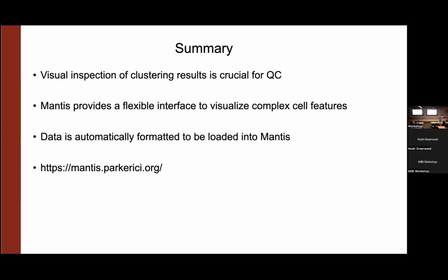Yes, Cameron. Does Mantis have a mechanism for cell reassignment? Would you recommend it for cells in error, where you just say one or two cells, not that many? Wow, you and Kelsey are having a mind meld right now.